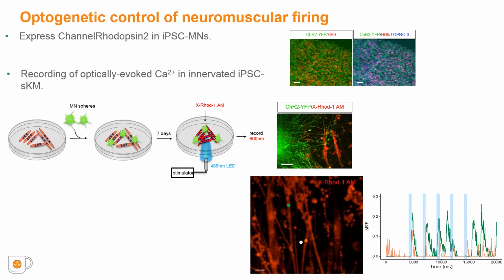Here, we demonstrated evoked calcium response in 2 innervated myotubes, where the calcium intensity changes in response to multiple pulses of blue light firing. Despite this success, this methodology is low throughput and requires manual recordings, making phenotypic analyses difficult.